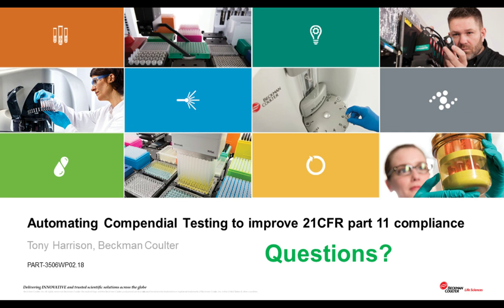All right, your next question. How does the PAT700 ensure the integrity of the PDF electronic records that it generates?